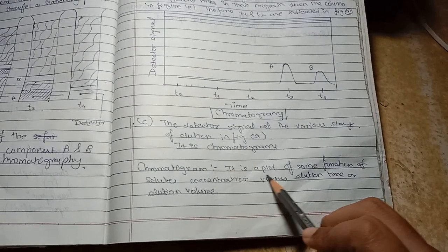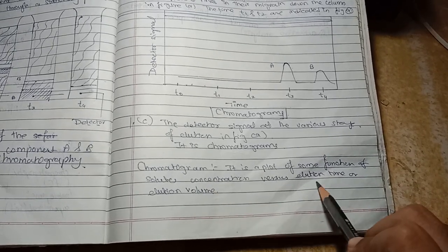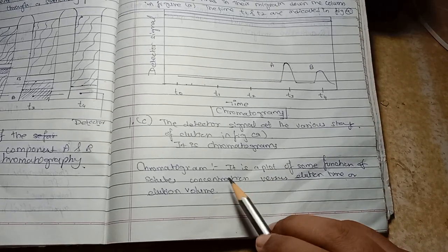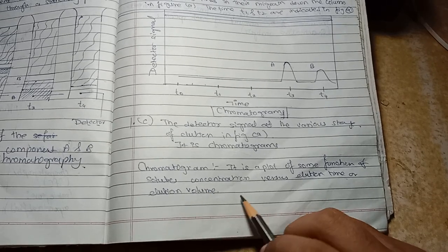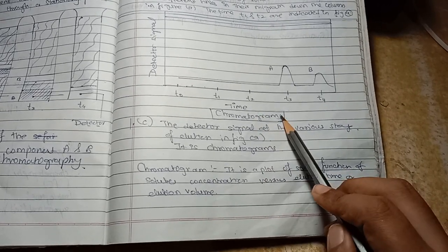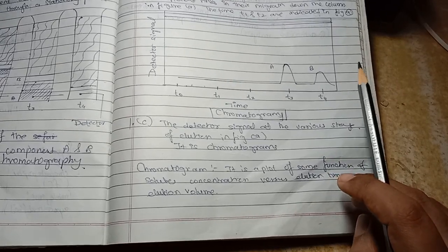Now what is a chromatogram? It is a plot of some function of the solute's concentration versus the elution time or elution volume. It's a graph plotted with the solute concentration versus the elution time or elution volume. Most often, elution time is used as the x-axis. We are going to learn more about chromatographs.